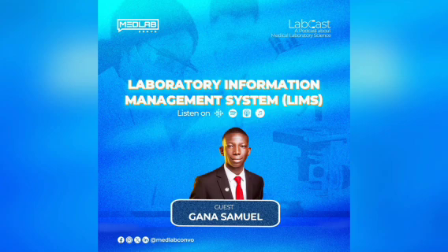Because you have used LIMS, the LIMS will tell the machine what to do without you stressing yourself to enter anything into the machine. And once the machine is done running the sample, it will transfer the result back to the LIMS, which prevents you from making any mistakes, maybe from entering results. So that's that. Thank you very much.